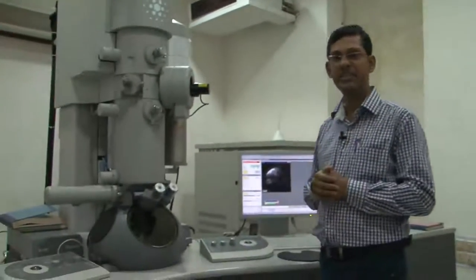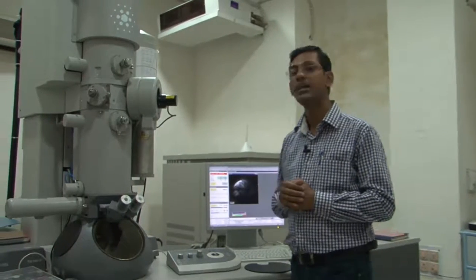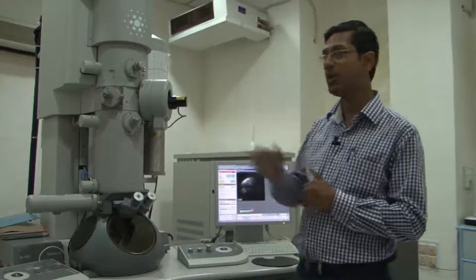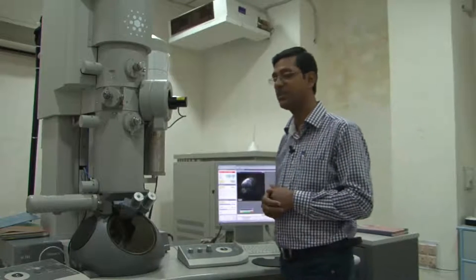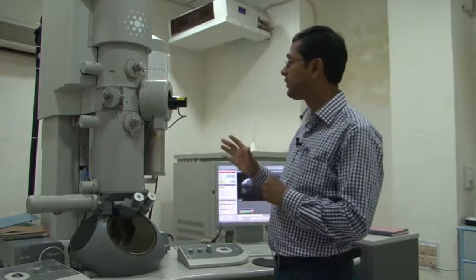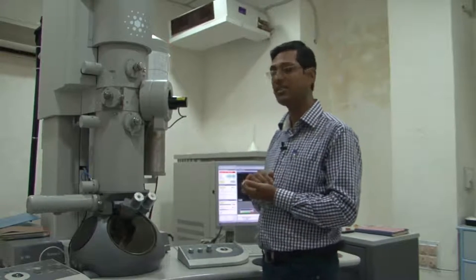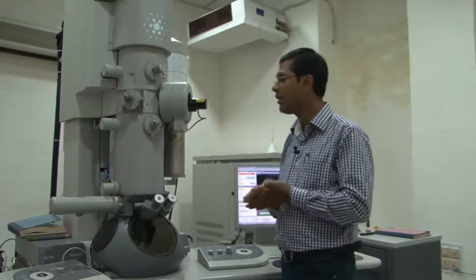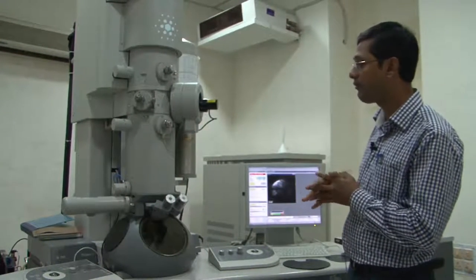And then you can also have a sample cleaning system. Before you put the sample in, one can clean it using a plasma cleaner. Nowadays we also have a plasma cleaner, which I will show you just after I finish the discussion here. Using the plasma cleaner, one can clean the sample very nicely so that one can get a very nice region of the sample and view it. Well, these are all background things one needs to have for a microscope.